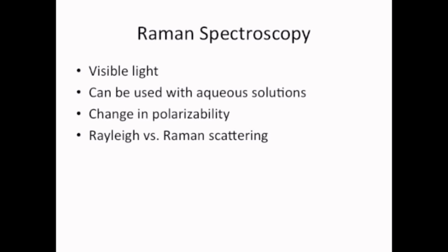Light can be scattered in two ways: elastically, commonly known as Rayleigh scattering, in which there is no non-kinetic transfer of energy between the molecule and photons, or inelastically, known as Raman scattering. Raman scattering involves the transfer of energy between molecule and photon. Modern Raman spectroscopy instruments are designed to filter out the Rayleigh light because only 1 in every million photons will be Raman scattered.